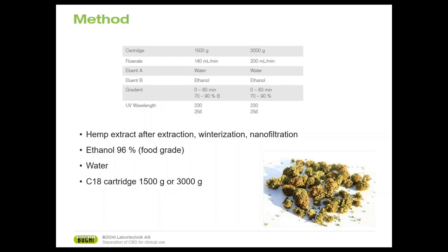So you cannot run all the cartridges with the same flow rate, which means in the small ones you can use lower, but in the big ones you can go higher. If you want to use 200 ml per minute in the 1.5 kilo, your back pressure could be way too high and maybe it is impossible to do it. But with proper method optimization, you can decide what your maximum would be.